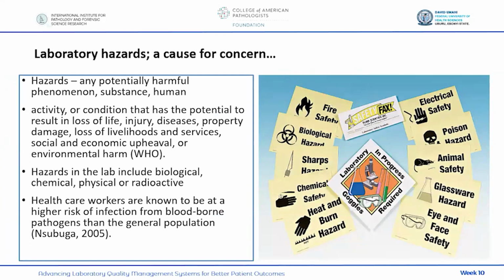Now, to emphasize the importance of this lab safety, let's talk about the lab hazards. Because for us who work there, a lot of times we don't take it as seriously as it should be, possibly because we've worked there for a long time. Somebody might have worked there for 10, 15, 20 years, and maybe luckily he hasn't had any injury, he hasn't been exposed to any lab hazard, or you haven't seen somebody who has had that. And so you're like, why do we talk about it? You kind of play it down, okay? But the fact that you've not experienced it, you've not seen someone who has experienced it, does not make it less harmful, does not make it less hazardous.